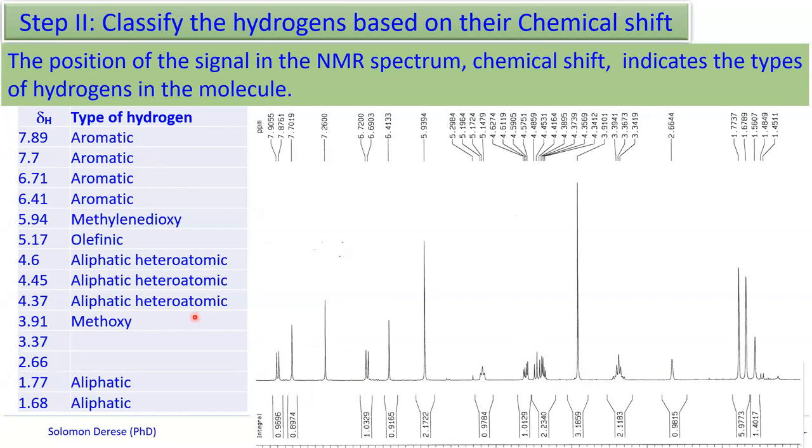Some of which, at the beginning of your investigation, you may not be able to determine, but as you interact with the data and get additional data, it is possible for you to determine what resulted in all these specific signals in the proton NMR.